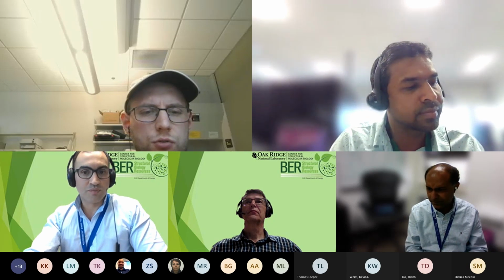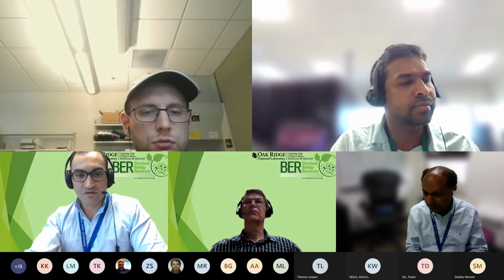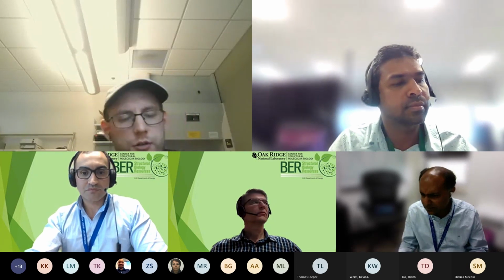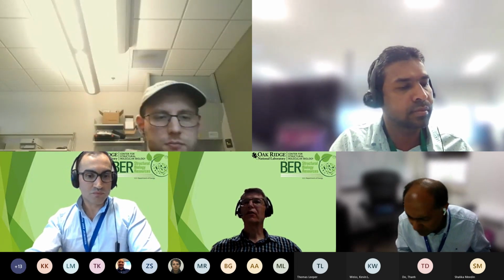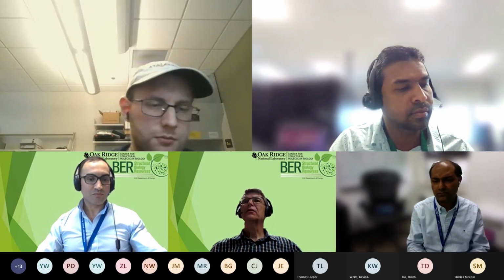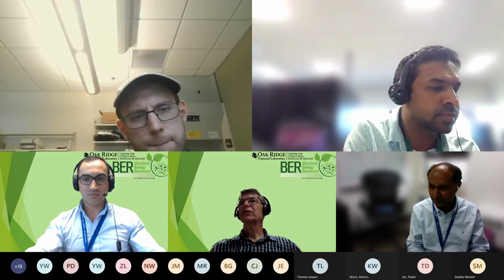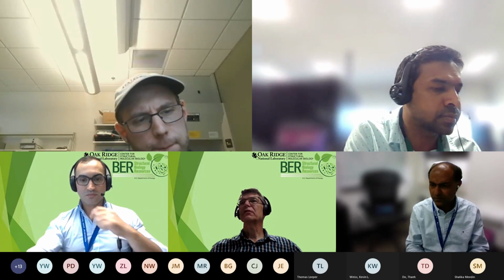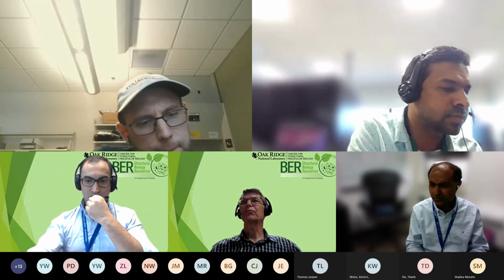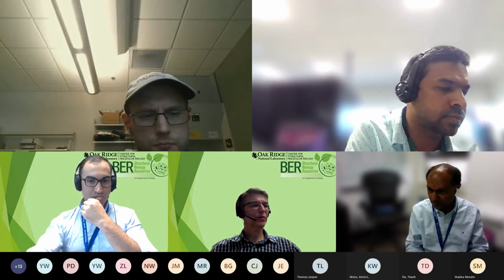I think the question is how common is it that the His tag causes aggregation? Yes. So I don't know. Kevin might have some input on this as well, because he has worked with a lot of proteins. I think he's still on the line. Kevin, do you want to say something about that one?